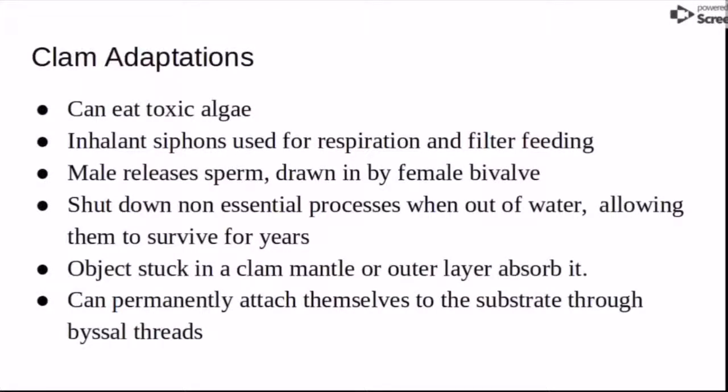It's fine. So then another one is that when an object gets stuck in a clam's body and shell, it can be absorbed by the mantle or even the outer membrane. Over time, layers and layers of it will go over the object, and eventually it could produce a pearl. And a final one is they can permanently attach themselves to the substrate through byssal threads.